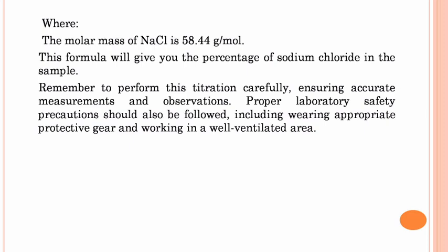Note: remember to perform this titration carefully, ensuring accurate measurements and observations. Proper laboratory safety precautions should also be followed, including wearing appropriate protective gear and working in a well-ventilated area.